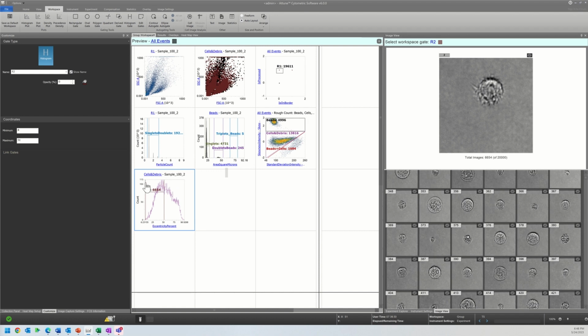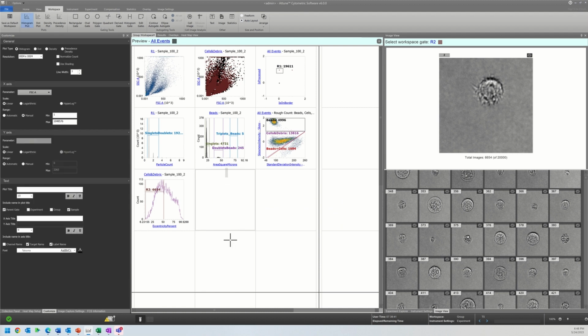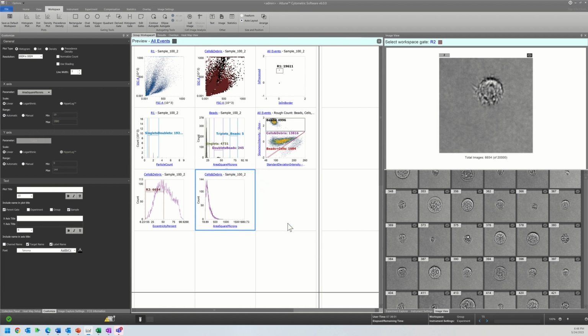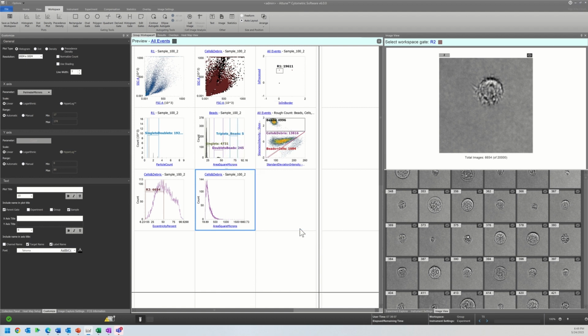and just eliminate everything upstream. Something else that is very useful is the area and the size parameters, because we know that anything that is significantly large or significantly small is not going to likely be a healthy whole cell. So we can look at the area square microns, but we can also look at the perimeter. So either of these would work. I'm just choosing perimeter because it's a little easier to see.